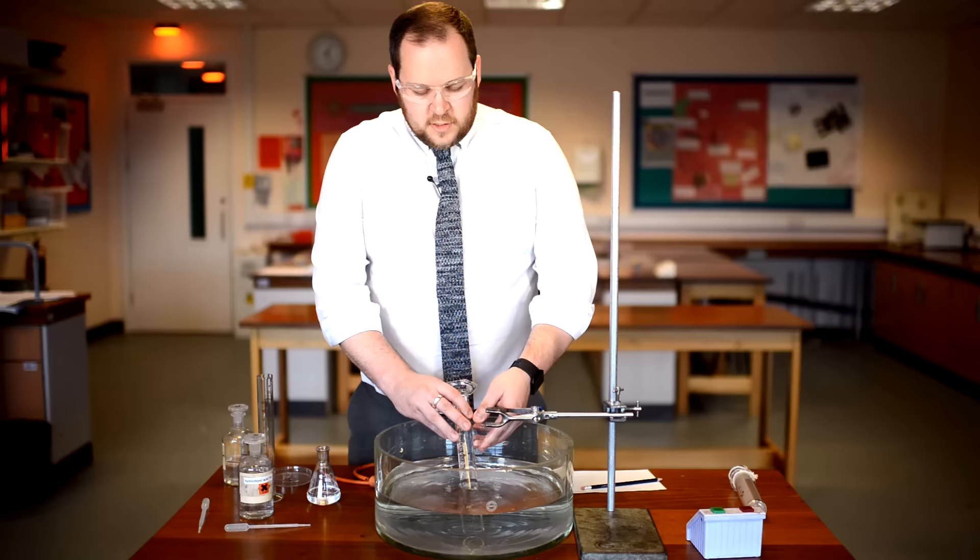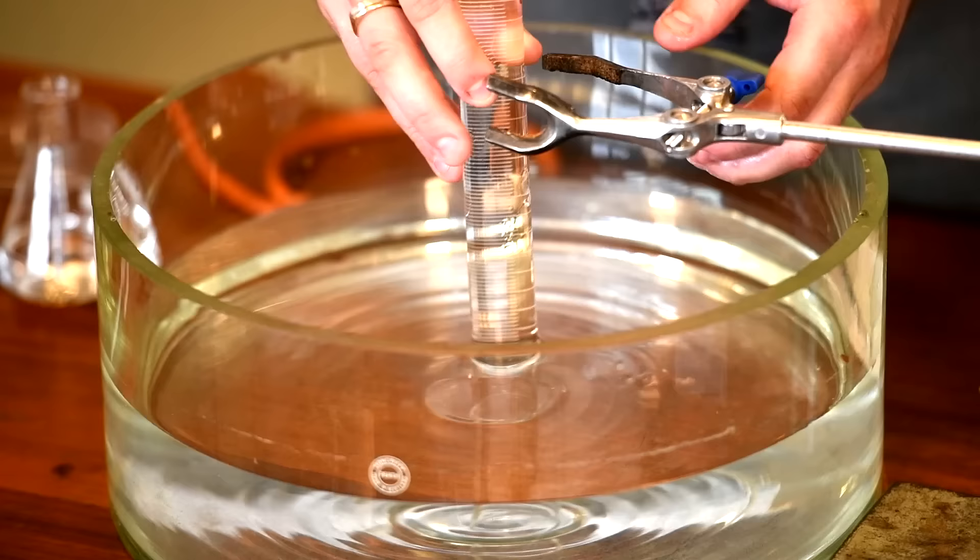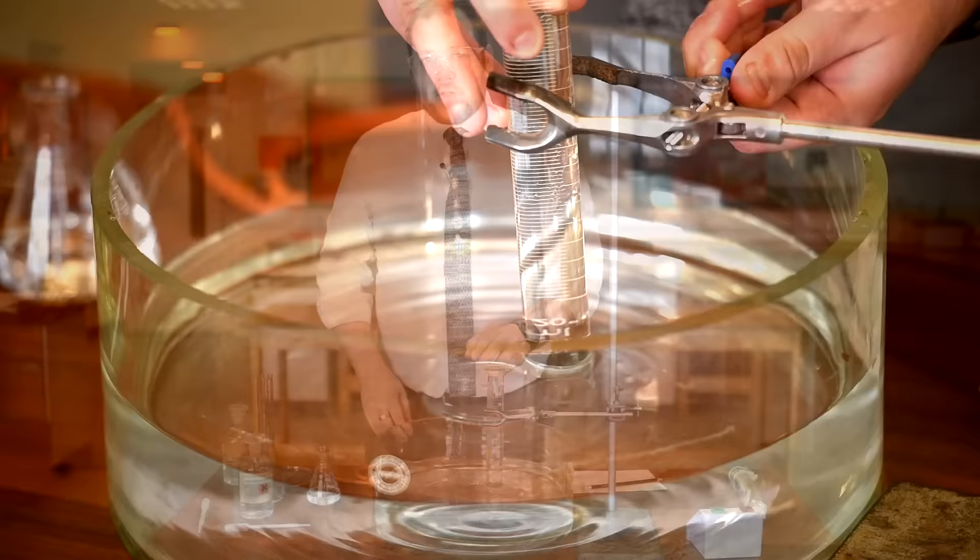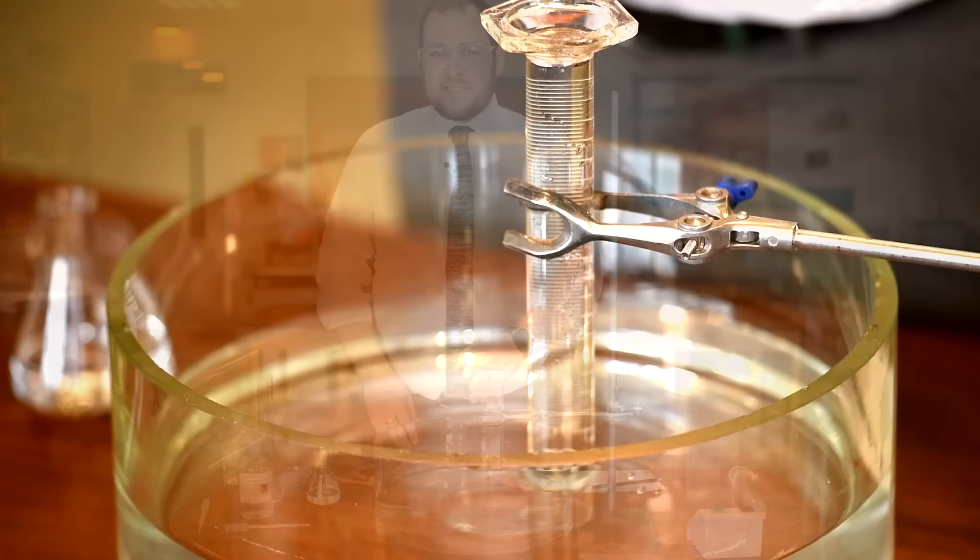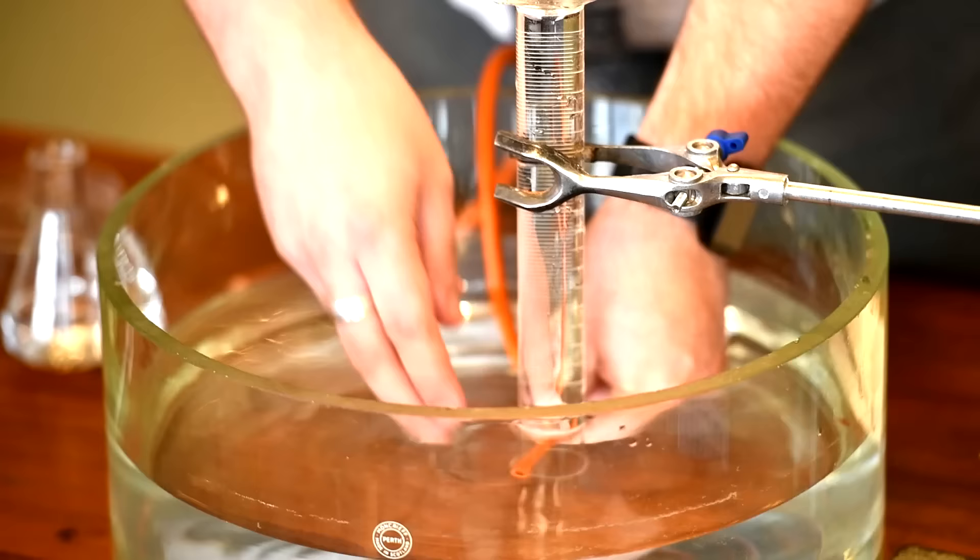You then need to clamp the measuring cylinder in place about one centimetre off the bottom of the trough. Make sure that you can see the scale on the measuring cylinder because you're going to need to record the gas being produced every 10 seconds. Put the delivery tube into the bottom of the measuring cylinder, like so.